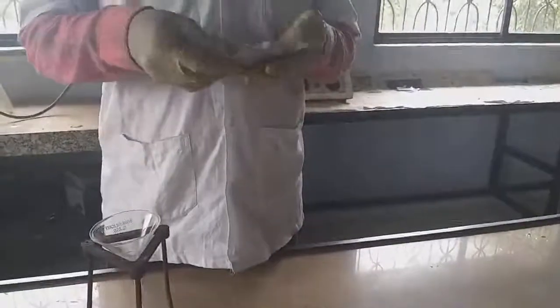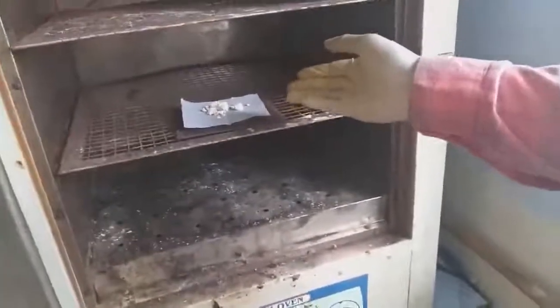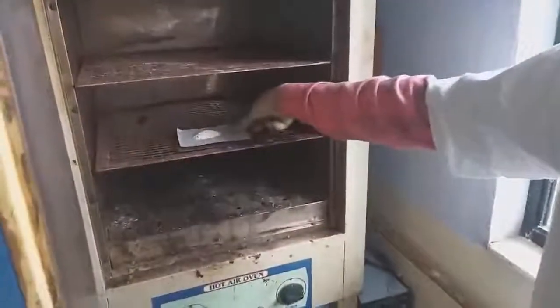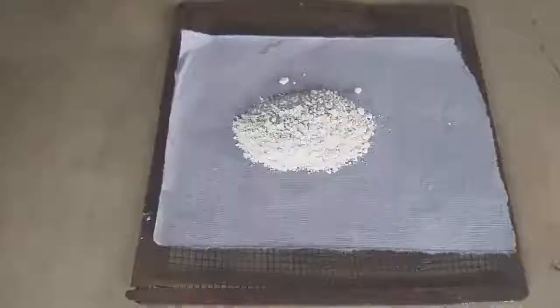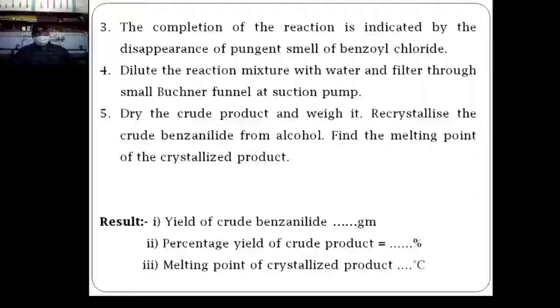Now take out the crude benzoanilide for the drying process to remove moisture from it. For drying, keep the crude in the hot air oven for 10 to 15 minutes. After drying, take it out from the hot air oven. Finally, the practical of synthesis of benzoanilide from aniline is complete.